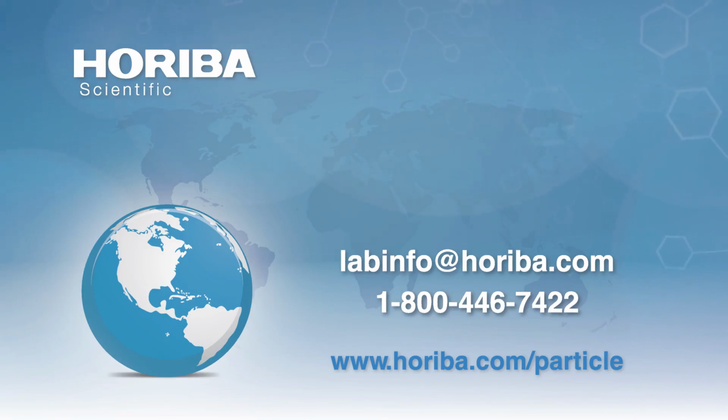Thanks, Jeff. And if you're wondering, Jeff is our product line manager. He's also our speaker for the Particle Characterization series that takes you through multiple steps of considerations when looking at particles with laser diffraction. The next question is, what is the best method for dry metal powders?